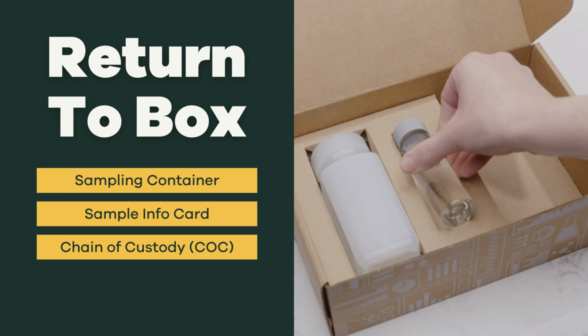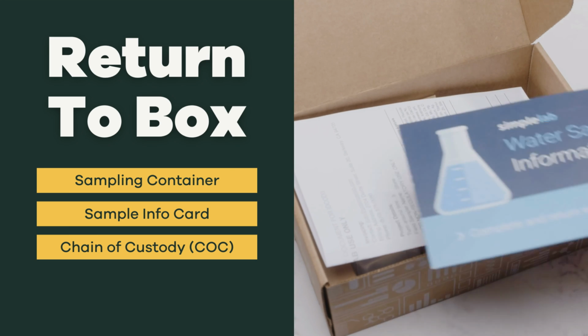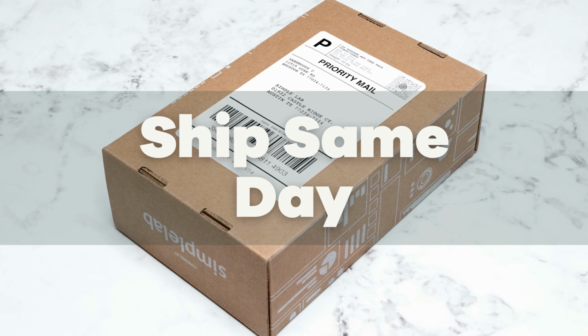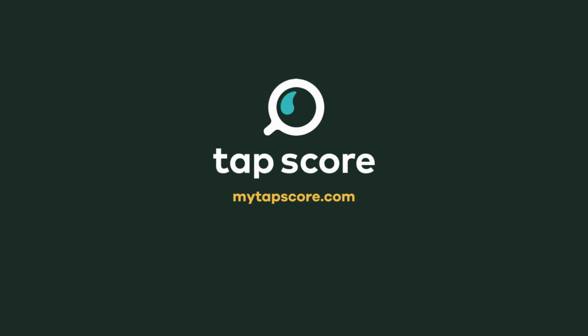Return everything back to the box and make sure to include both the COC document and your sample info card. Close the box and apply the prepaid shipping label. Ship your package using the method indicated on the label the same day as you took your sample, and we'll take care of the rest.